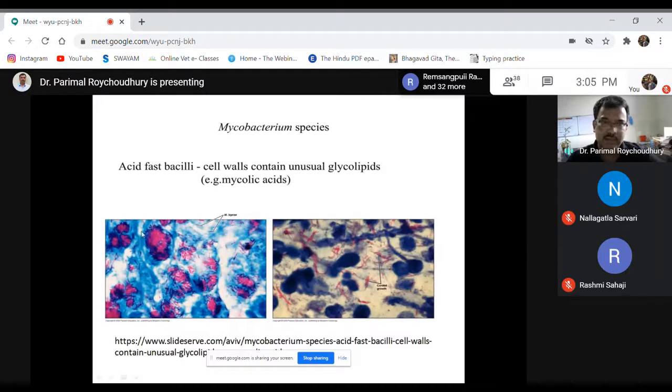This is full of acid fast bacteria. This might be a full-grown tuberculosis case. We can see so many bacteria in this microscopic field. Thereby it helps us in differentiation and identification of specific bacteria. This is Mycobacterium leprae, which causes the disease leprosy in humans.